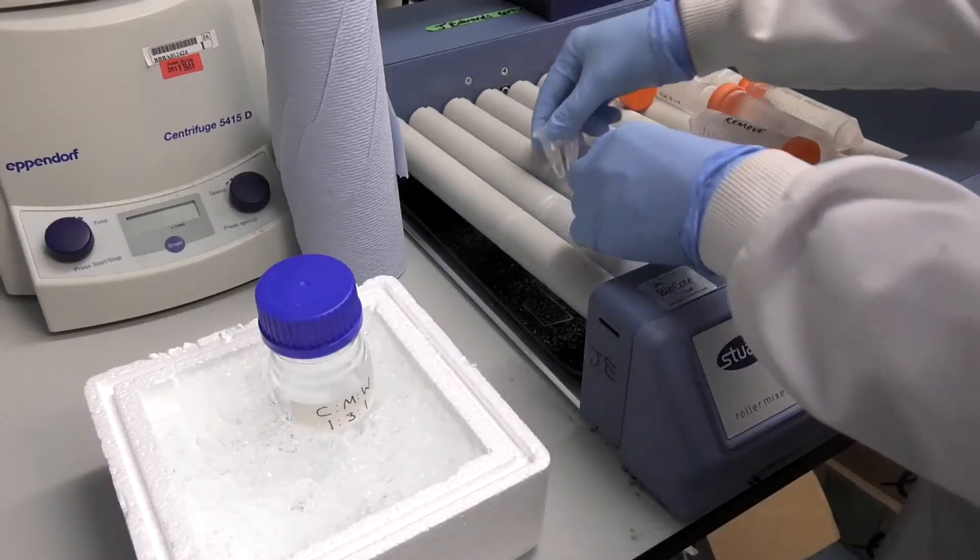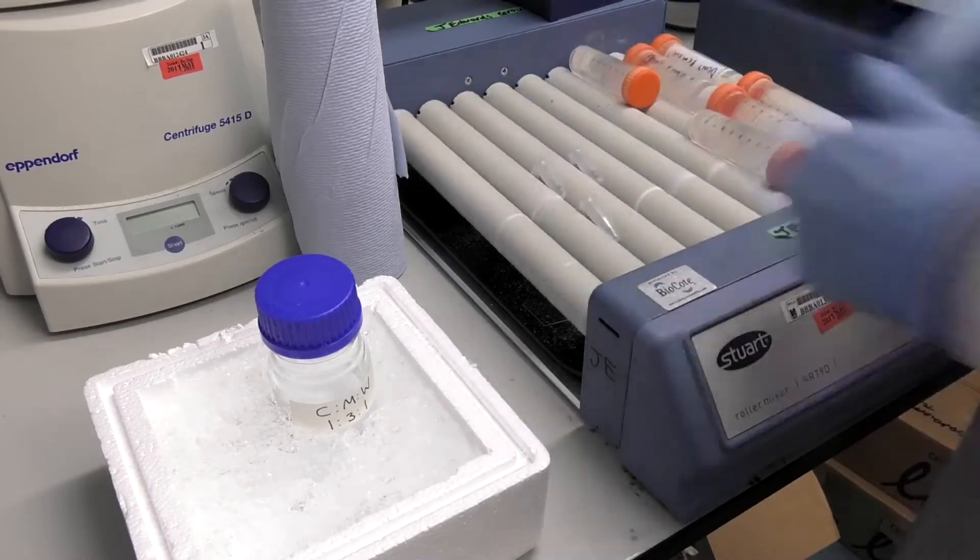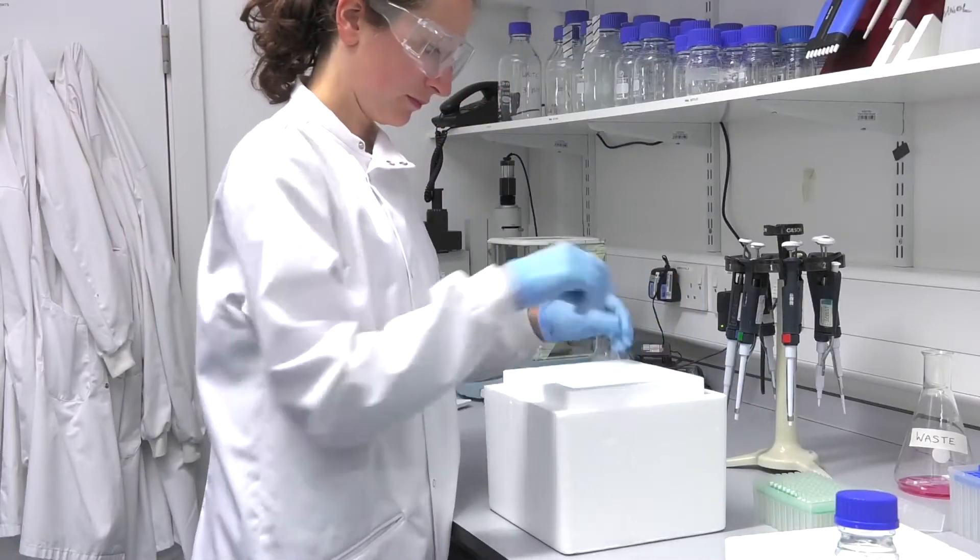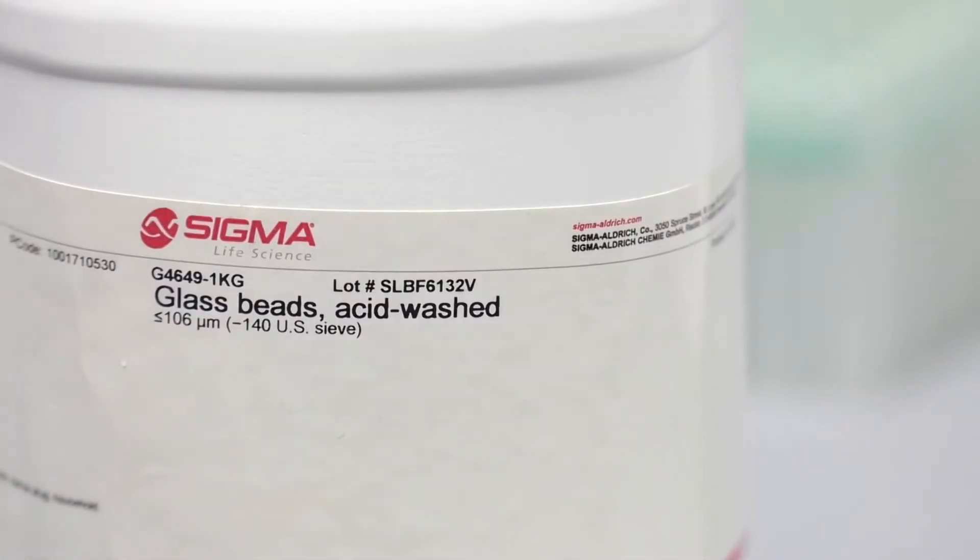Step 6. For many cells, you can leave the suspension on a shaker for 1 hour at 4 degrees C. For bacteria, you may need to perform freeze-thaw cycles, or use glass beads to lyse the cells. Yeast will also need glass bead lysis.